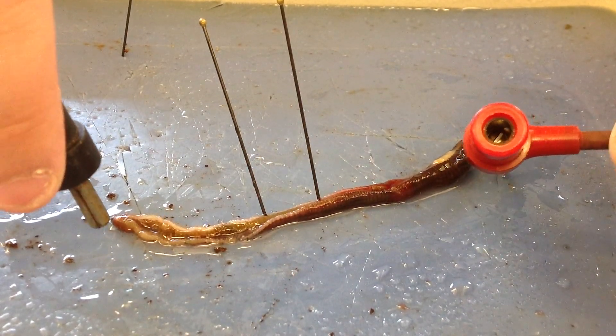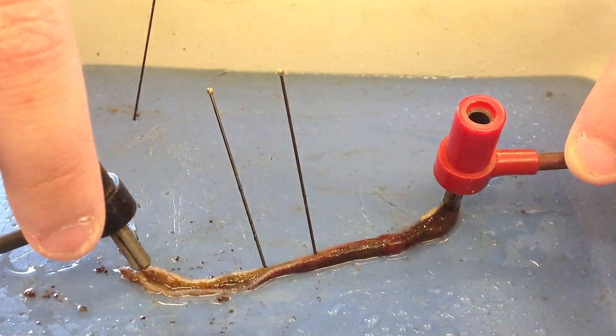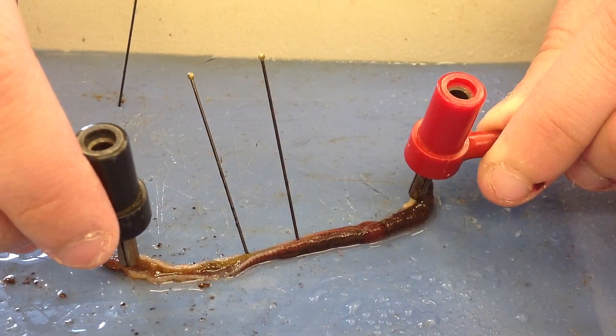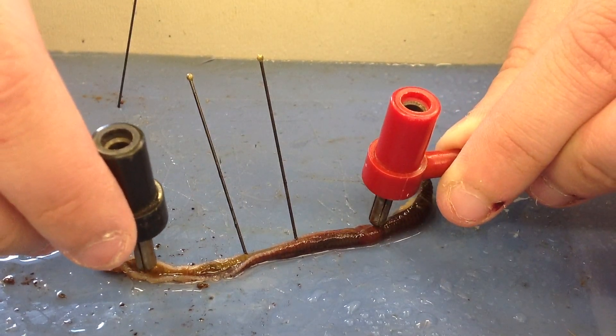There we go. I think you need to touch it to the inside. Move the cord. Touch it to the inside. Did you cut that? Touch it to the ovary things. It's not happy. It does not enjoy the current.